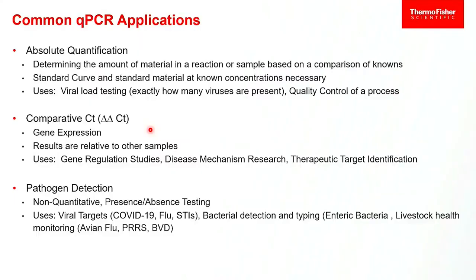If I go outside, say we're in Dairyland, to a dairy farm and want to make sure that the cattle are well, or there's a virus going around and I want to make sure they're not sick, I can do sampling around there, test for those targets, and I can put the farmer's mind at ease knowing that his herd is healthy and is not likely to get sick, and we don't need to call the vet. So we can save money, we can be proactive with the health of the animals, lots and lots of different things.